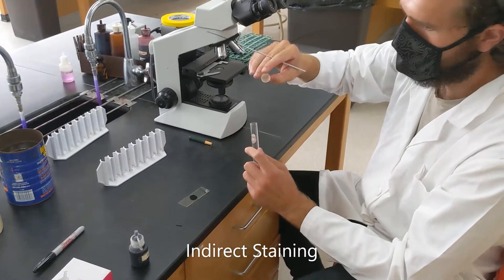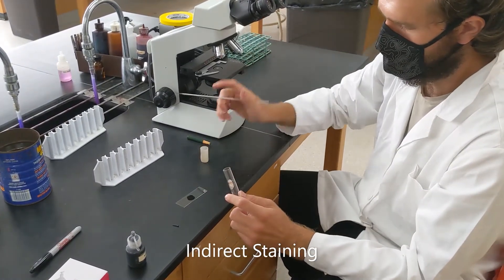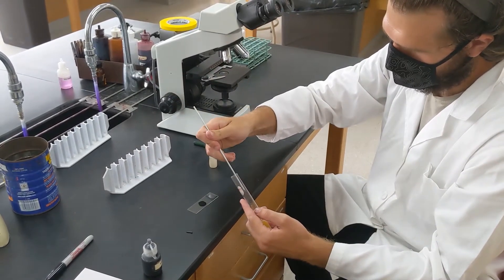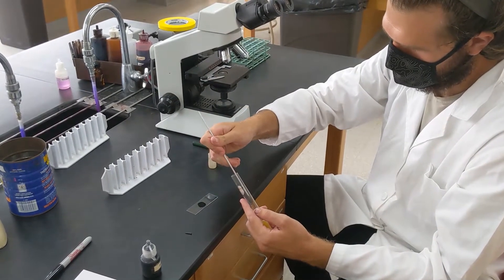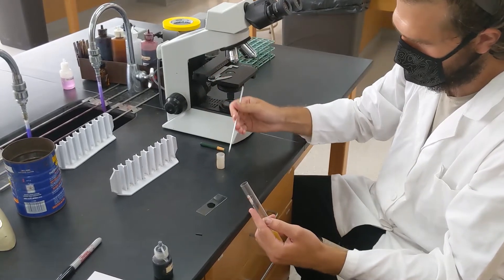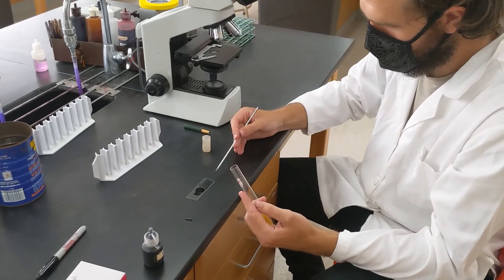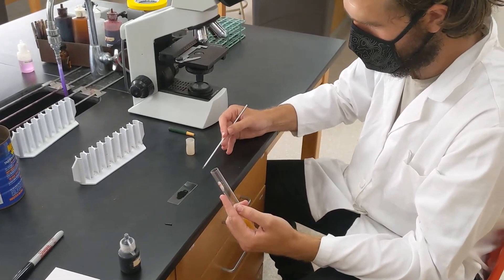So for our indirect stain, we've got our drop of nigrosin on the slide. I'm going to take our mix culture, the same thing that we used to streak our plates, and add that to the stain. Then spread the stain out all across the surface of the slide.